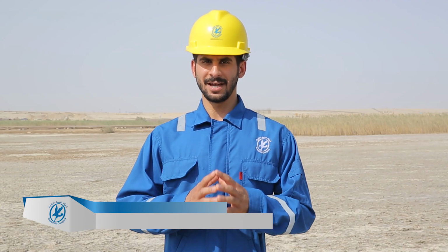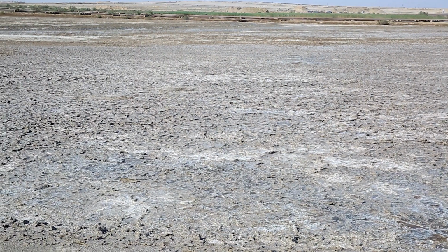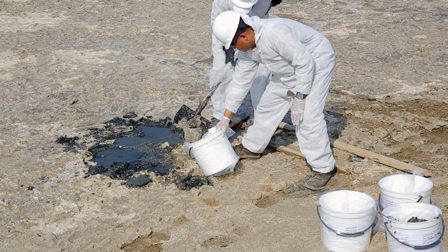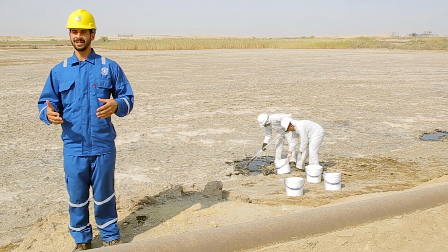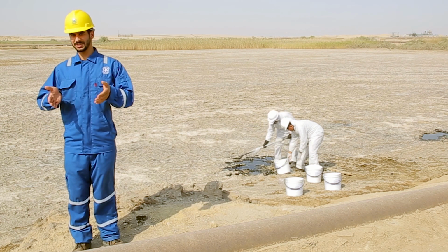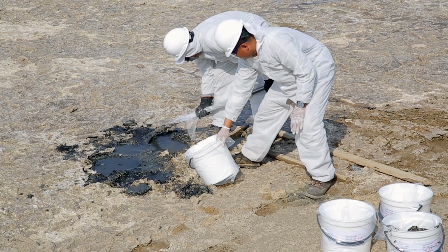Currently located in southeast Kuwait in the Burgan oil field, we are at the site of a wet oil lake, where a site collection procedure is being undertaken. We're studying the characterization of the sludge and the thickness of it. Now, as you can see below, contents of the sludge are going to be transferred to a lab for further testing and analysis to determine the best course of action to remediate this contaminated feature.